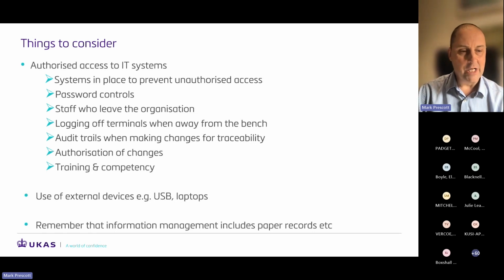I talked about authorisation for making changes, but also audit trails when you're making changes. Whoever's making any changes to the IT system, is there a record of traceability to show who has actually made that change? And make sure that person is authorised to make that change, and that they are trained and competent in the use of that system.